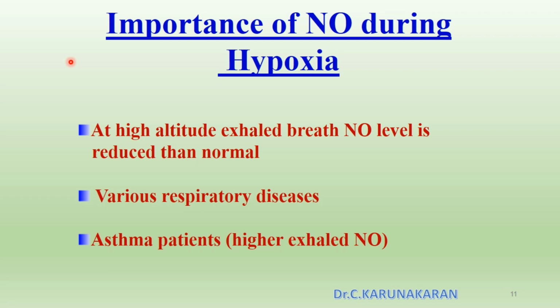As I said, nitric oxide is an important biomarker for hypoxia. I was asked by the DRDO to develop a biosensor for nitric oxide. Therefore, in another DRDO sanctioned project, we have developed a nitric oxide biosensor, because at high altitude exhaled breath NO level is reduced for hypoxia patients, and it leads to various respiratory diseases.